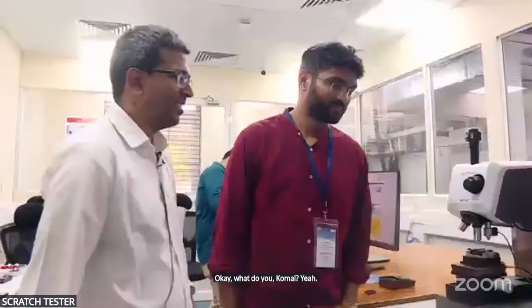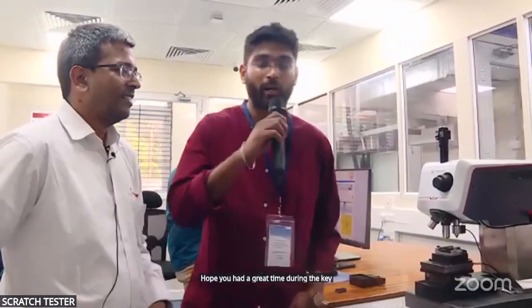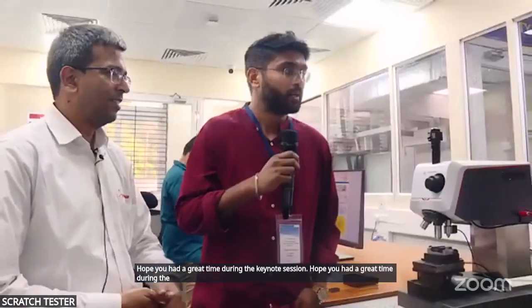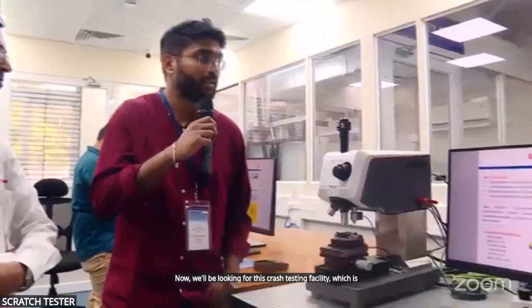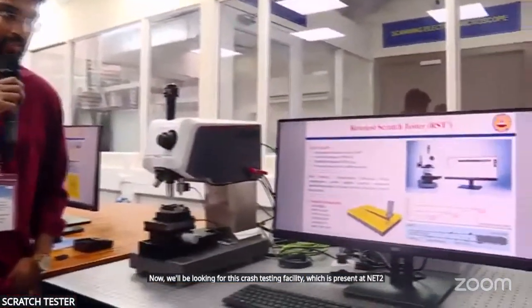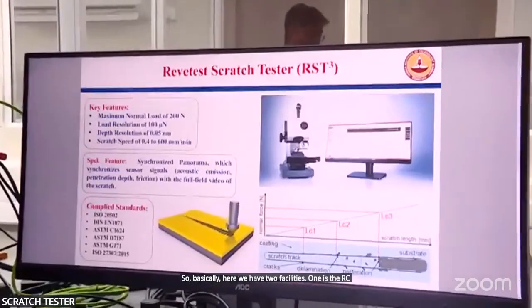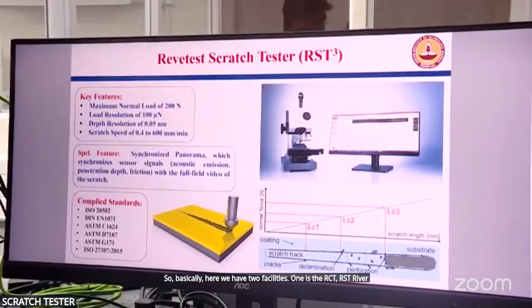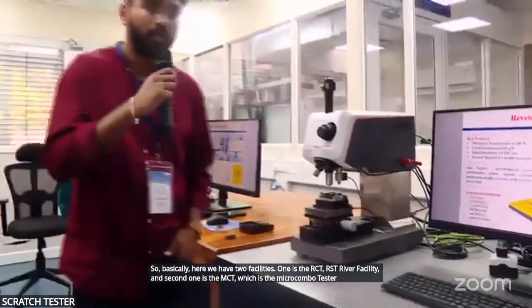Thank you, sir. Good afternoon, everyone. My name is Abhishek. Hope you had a great time during the keynote sessions. Now we will be looking at the scratch testing facility, which is present at NAC-2 IIT Madras. Basically here we have two facilities. One is the RST, the Revetest Scratch Tester facility. And the second one is the MCT, which is the Micro Combi Tester facility. So we'll begin with the RST facility.